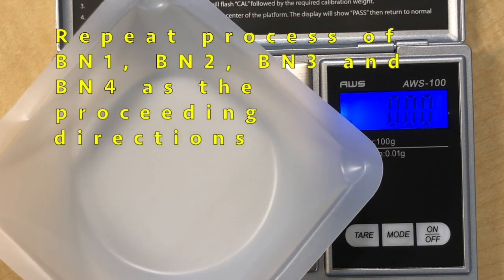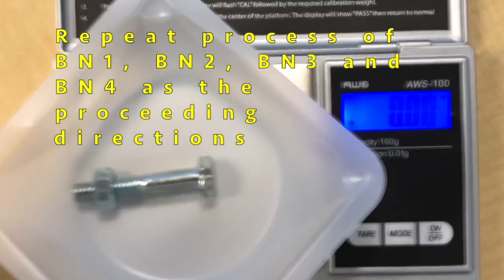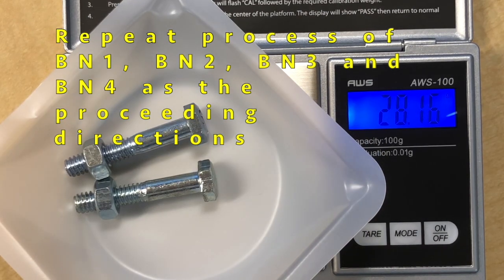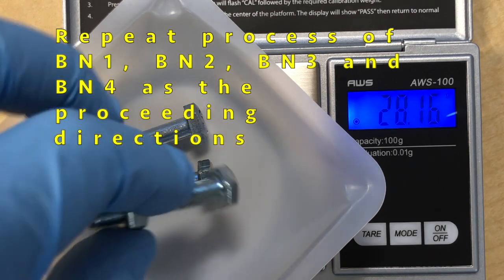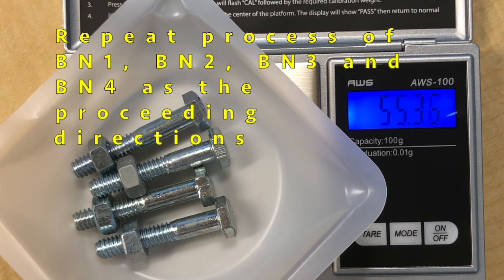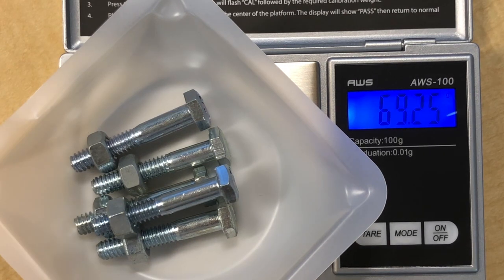Place the weighing bolt on the scale and then take one nut-bolt, a second nut-bolt, a third nut-bolt, a fourth nut-bolt, and a fifth nut-bolt, assembling five BN molecules total.